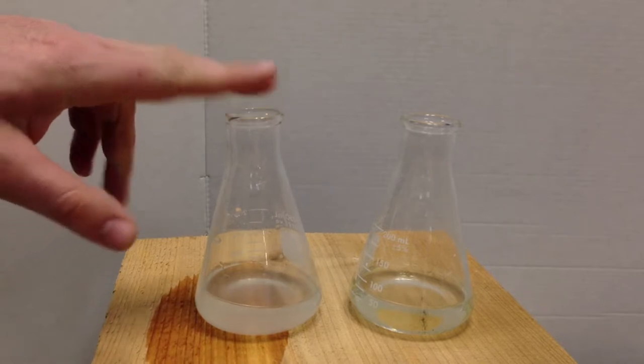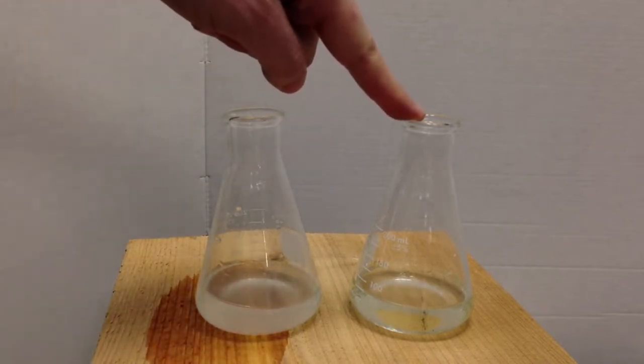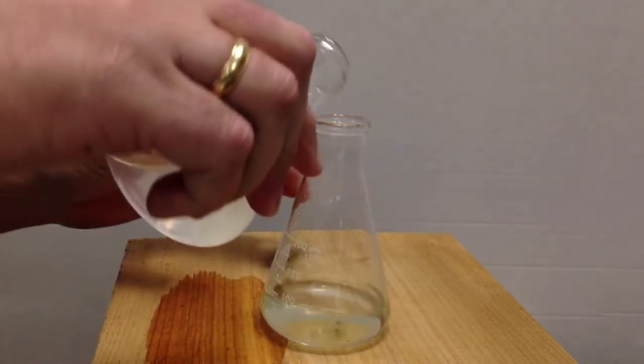Lead +2 from this beaker is going to attract and hook up with the iodine ion to make PbI2, or lead II iodide. And that is going to create a precipitate because the lead iodide prefers itself more, or attracts itself more, than water. So let's do that. Here we go.